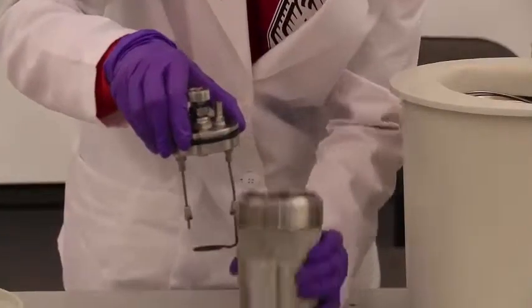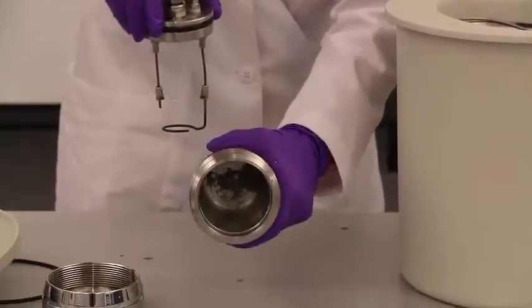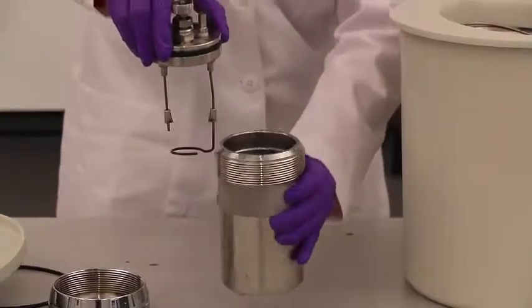Pull out the inside component of the bomb and notice that the sample and part of the wire are not to be seen, having been combusted into carbon dioxide and water.